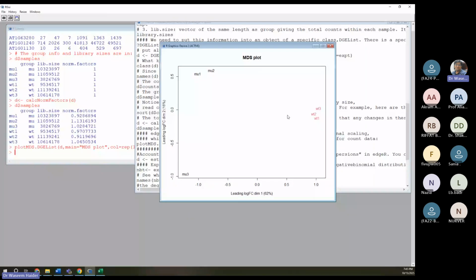So we gave the data to the program, and then it looks into the similarities and differences, and separates the things according to whatever it finds. If they are similar, they are close to each other. The ones which are similar are together, and this one is different, so it is placed in another corner. It's like you give multiple things to a baby, and the baby recognizes the similarity among those things and starts separating toys on one side, electronic devices on another side, right? Glasses and dishes on another side. So that's how it goes on.